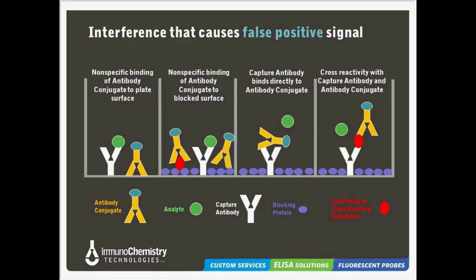So you're going to get a large positive signal that way, and you've got big problems because you've got something in there you didn't know about, and now you've got to figure out, well, am I going to have to get some new antibodies? You have to do something. Now, maybe you need a monoclonal, but it means you've got to go back to the drawing board. And if you're a first timer on this, that isn't really what you want to be facing at this point.